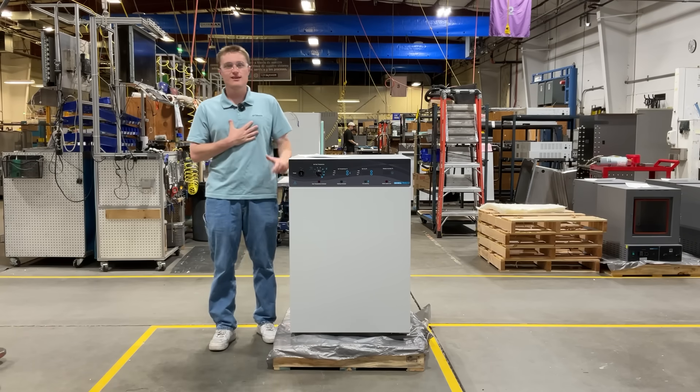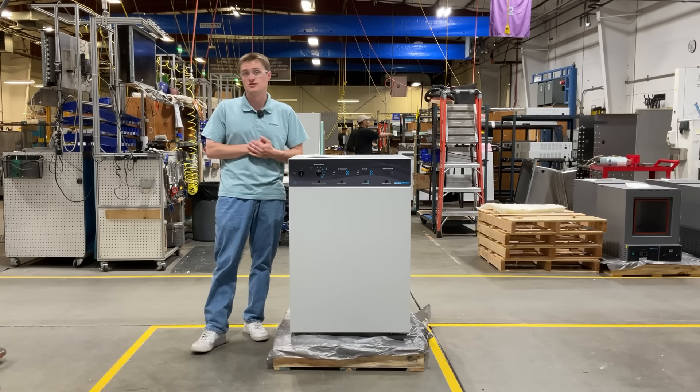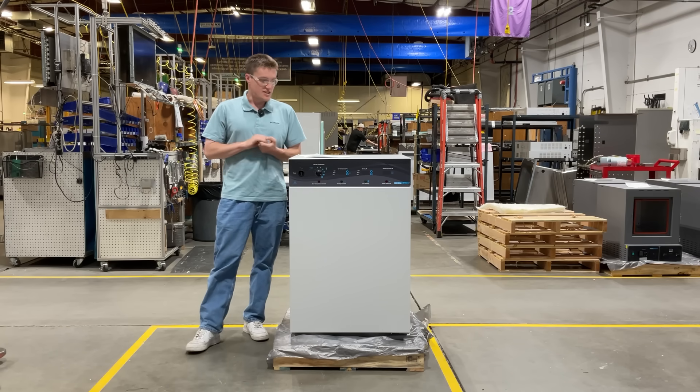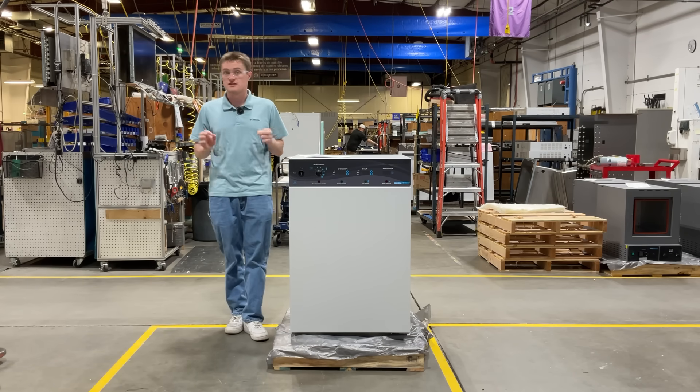Hello again, my name is Kord Sankseek. I'm a design engineer here at Sheldon Manufacturing, and today I'm going to be introducing the SCO5W CO2 Incubator with Water Jacket Technology, designed to provide unmatched temperature stability, contamination control, and optimal conditions for your most sensitive cell cultures.